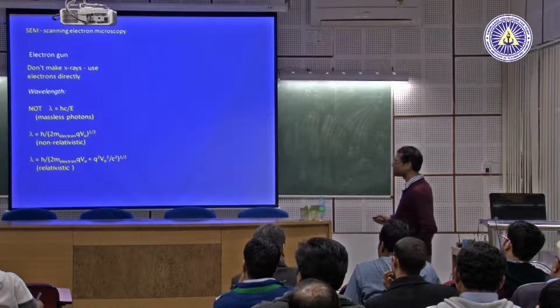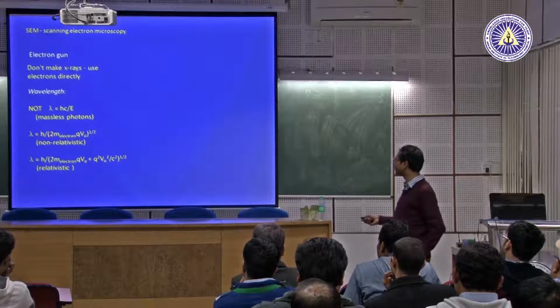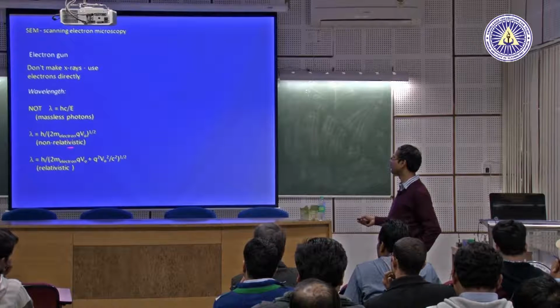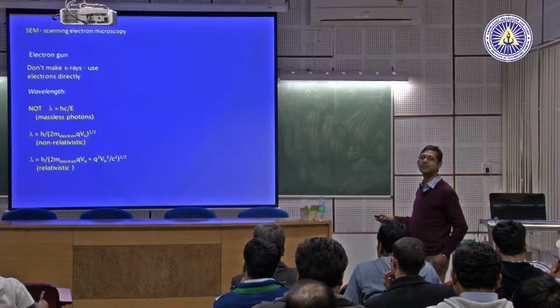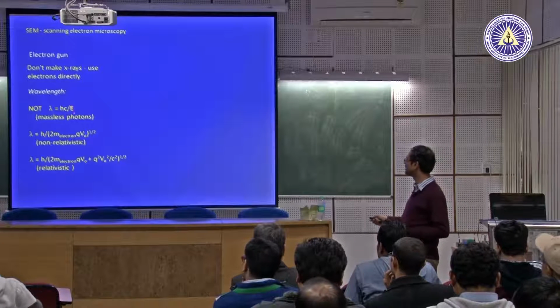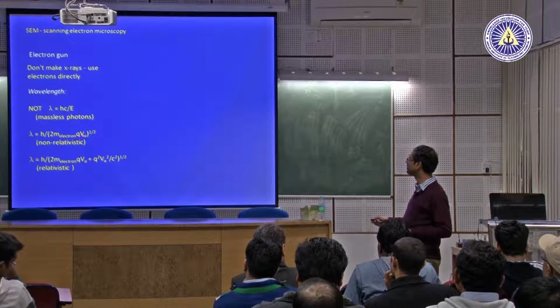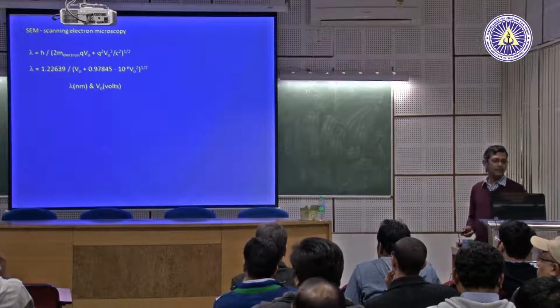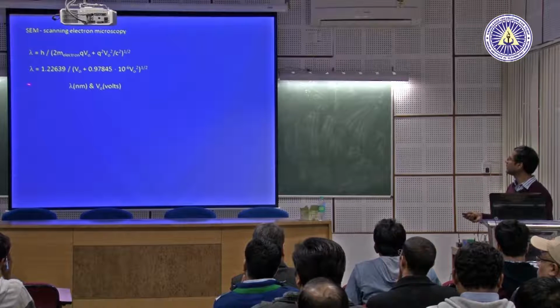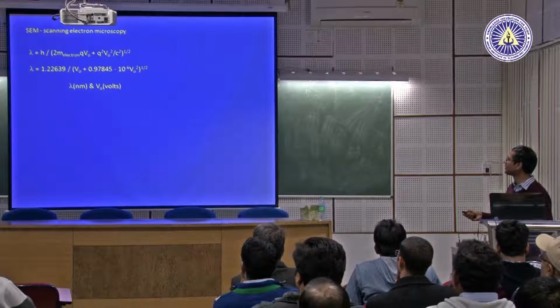But in a scanning electron microscope, because the accelerating voltage is very low, you can use h by m0 qv actually. This formula can be easily used, because this is the p actually. P is the momentum. This is not E, this is P, momentum. So momentum comes from mass into velocity and q. Anyway, I think here you can see clearly, you can convert in terms of volts and other things.